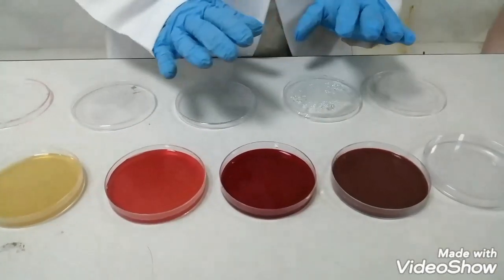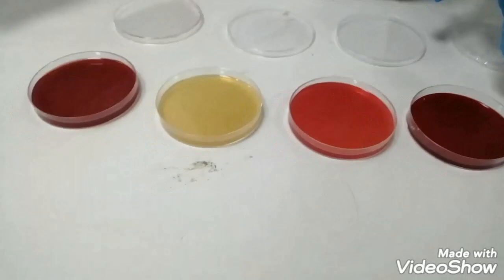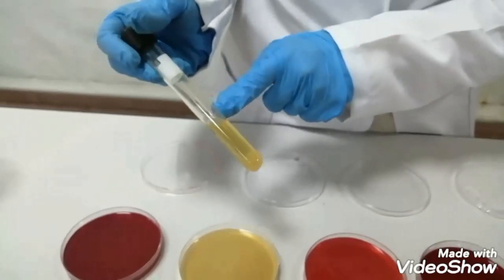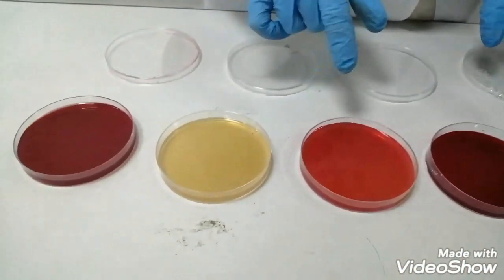We have different kinds of culture media. According to the physical state, either we have solid culture media or we have liquid culture media, like this. This is nutrient broth, an example of liquid culture media. And these all are examples of solid culture media.